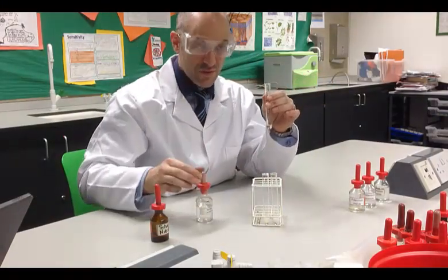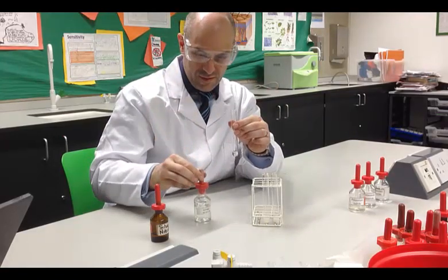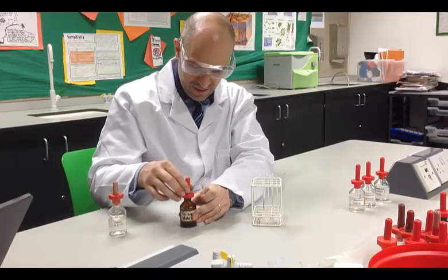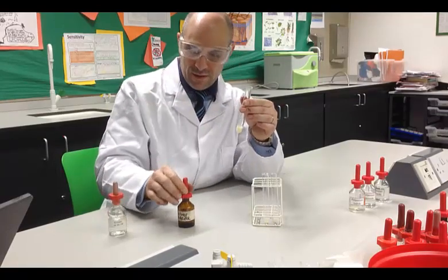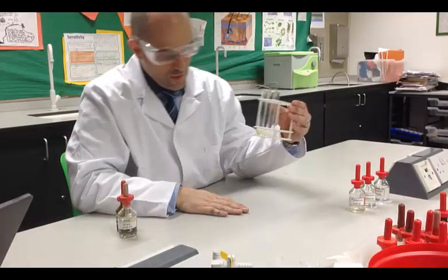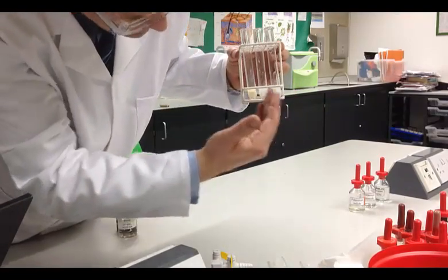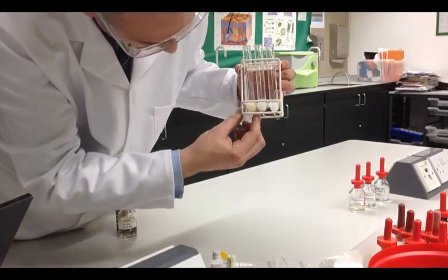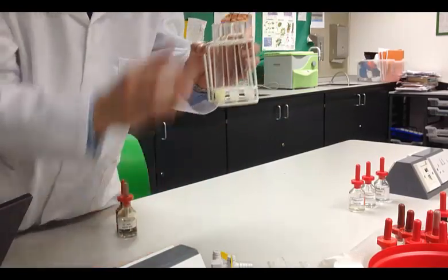Some nitric acid in order to remove solid. And the test reagent, silver nitrate. Just a few drops is all that's necessary. Notice how we get a yellowish precipitate. Right, so just to show you again, going from your right to left, chloride, pure white precipitate; bromide, an off-white precipitate; iodide, a yellowish precipitate.